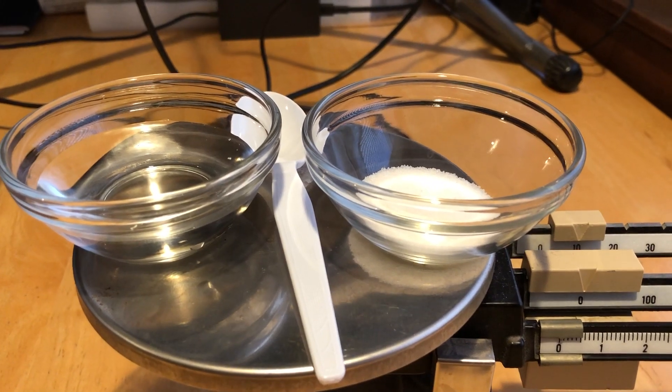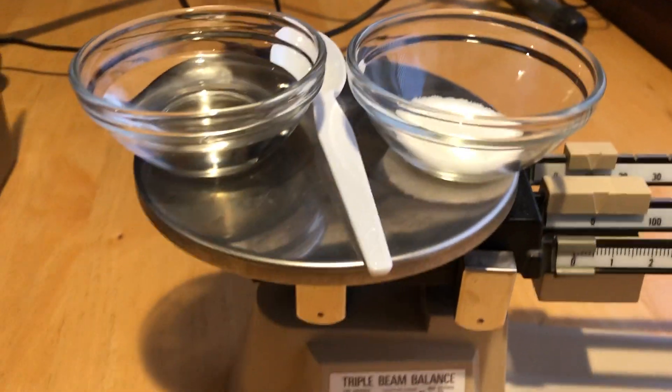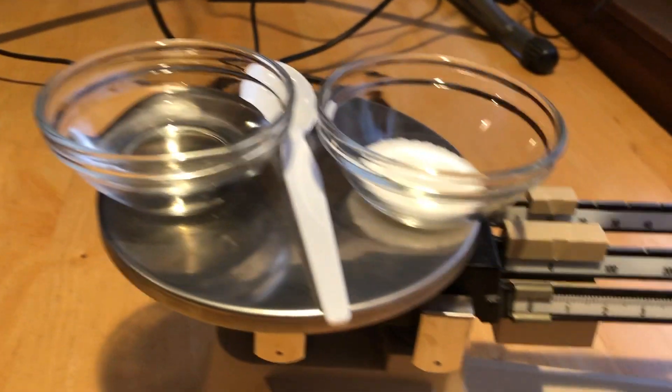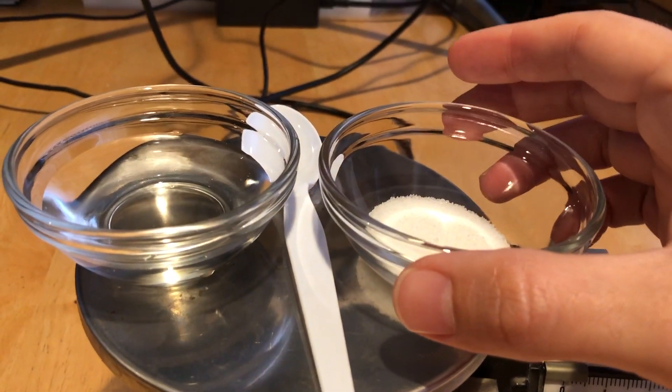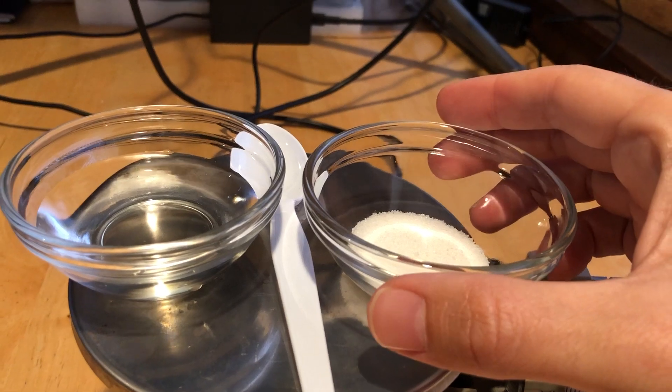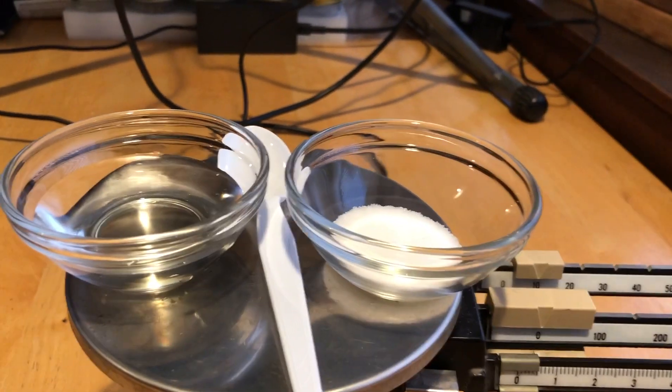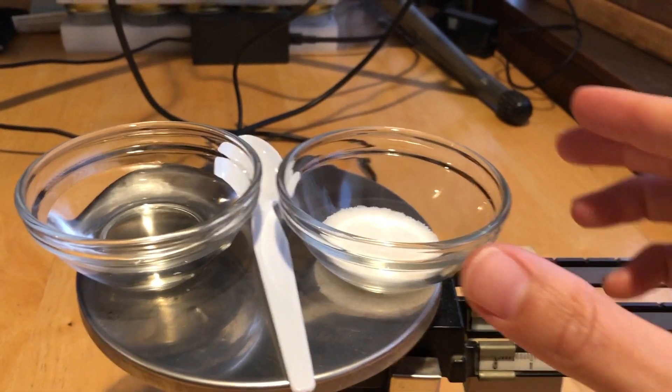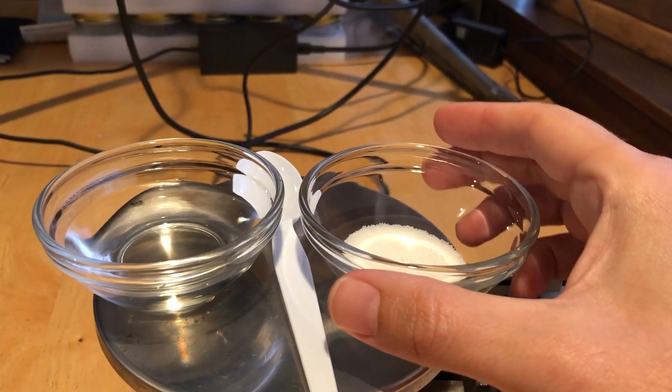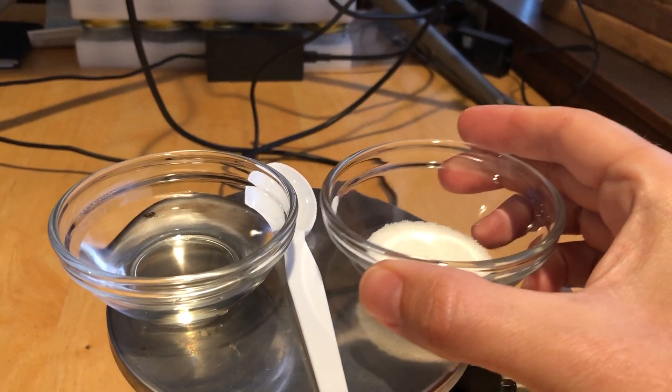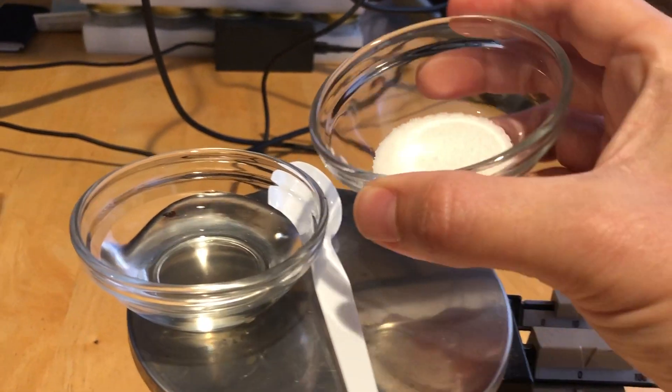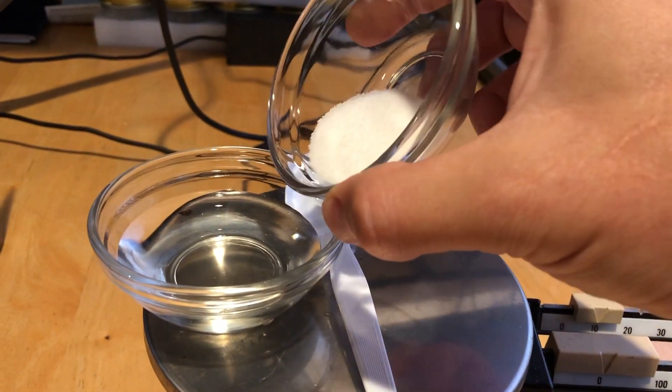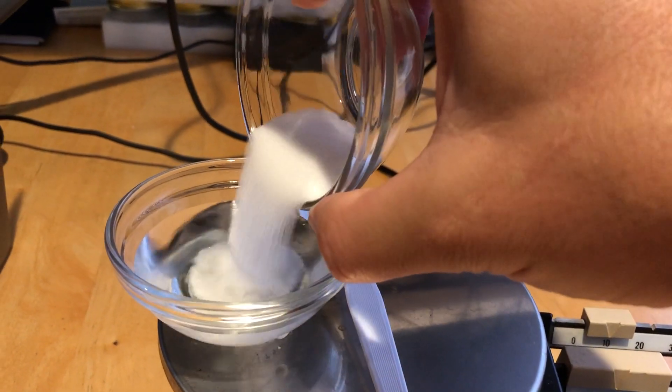everything on the pan. You're going to take the salt, find the mass, and then you're gonna take the salt and dump it into the water.